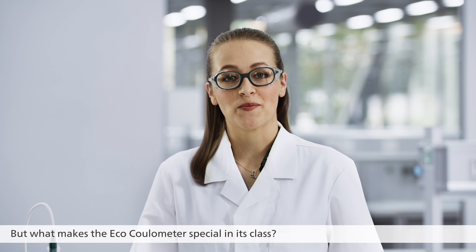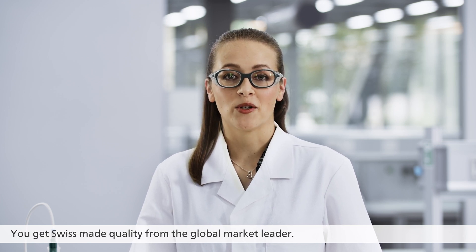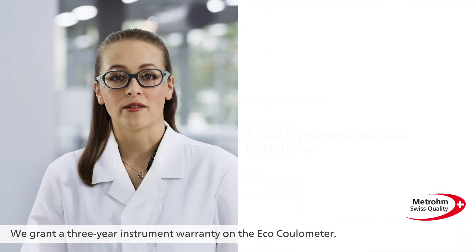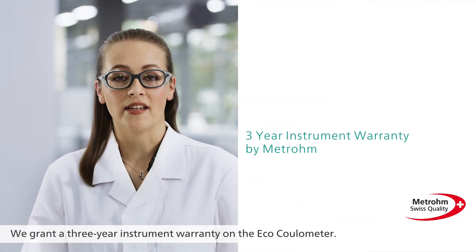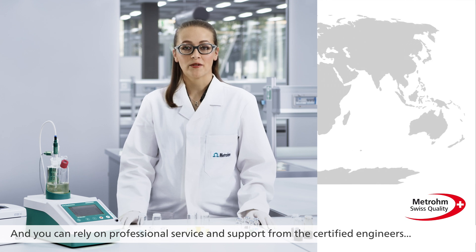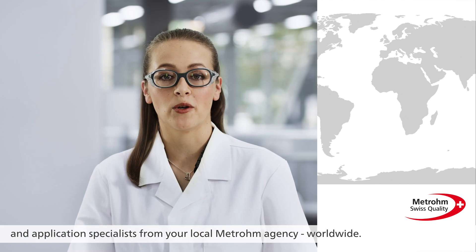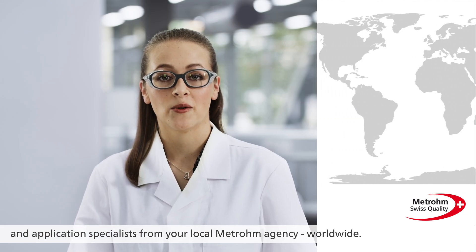But what makes the Eco Coulometer special in its class? You get Swiss-made quality from the global market leader. We grant a three-year instrument warranty on the Eco Coulometer, and you can rely on professional service and support from the certified engineers and application specialists from your local Metrohm agency worldwide.